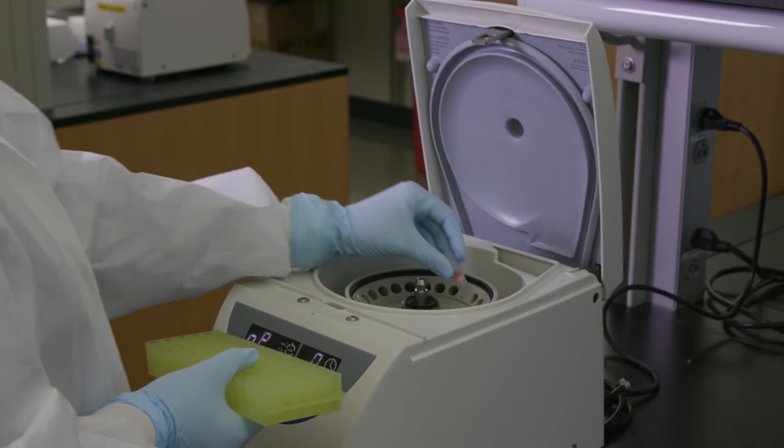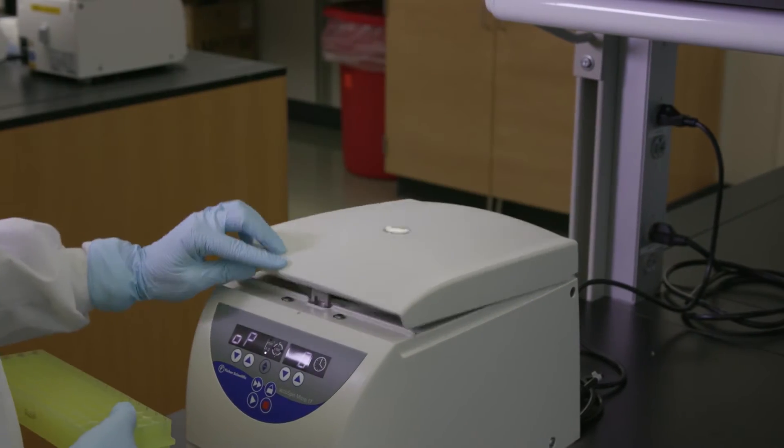Complete the sample application and later washing and elution steps by centrifugation, pressure, or vacuum.